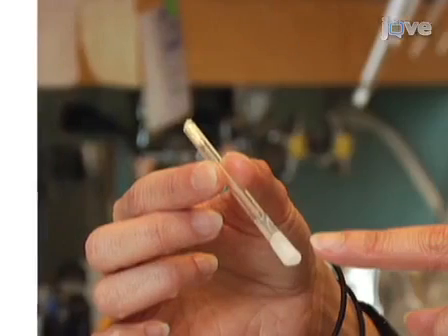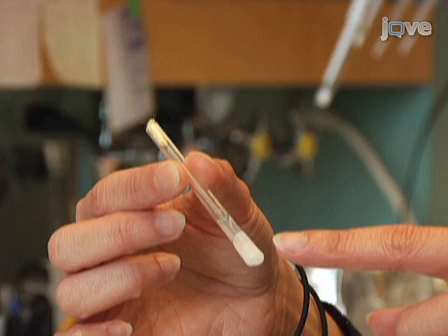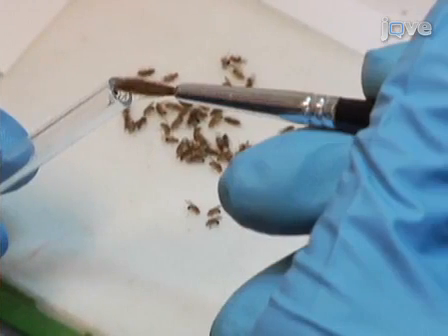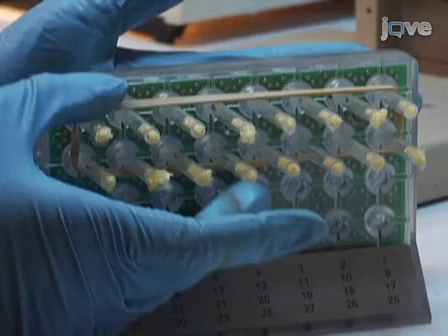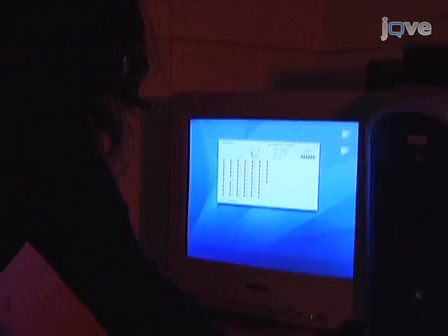As a second step, glass activity tubes containing a food source need to be prepared, which will serve as the fly habitat during the experiment. Next, 1-5 day old flies are placed into activity tubes, which are loaded in DAM activity monitors in order to monitor locomotor activity rhythms using the DAM system.